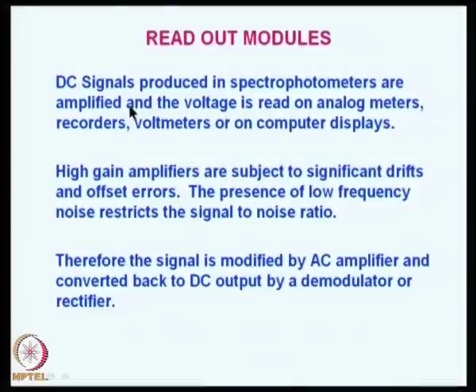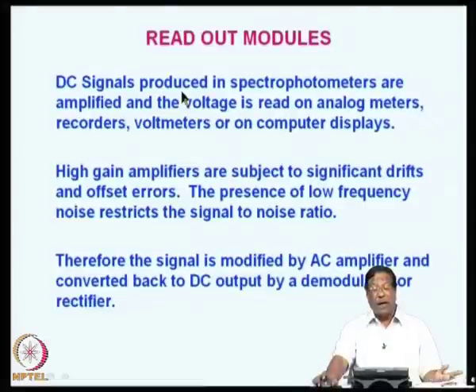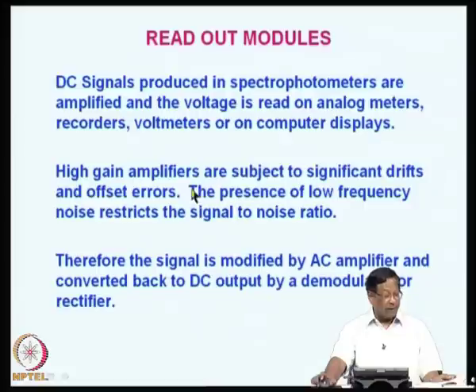Now, what about the readout modules? How do you read the signal? The DC signal produced in spectrophotometers is usually amplified and the voltage is read on analog meters, or it can be a recorder or a voltmeter, or it can be passed on to a computer through an RS-232 connection and then the computer displays it. High gain amplifiers are usually subject to significant drifts and offset errors.